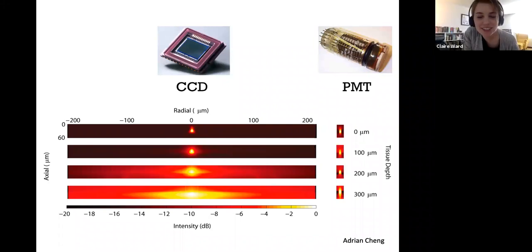Oh, yeah. I was just going to ask, are there types of imaging that, I guess I don't see the chromatic aberration thing as being a huge problem. It is a problem for certain things, but you could also use it to your advantage if you have different wavelengths across depths. If you're doing a Z stack, separating it by colors, you could excite different fluorophores with the separated bands. Is there any type of imaging?